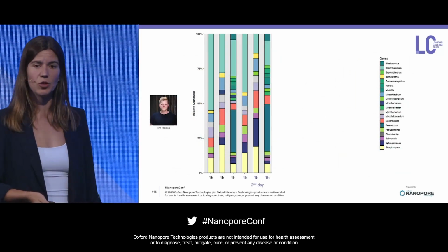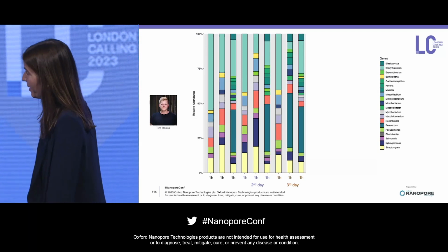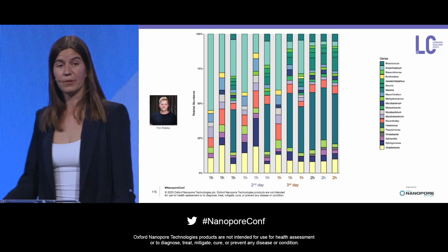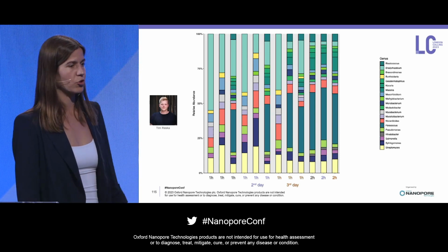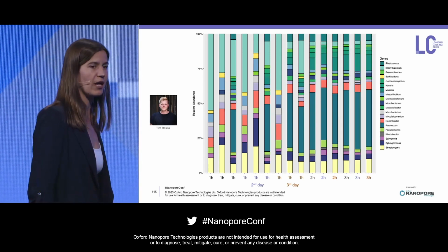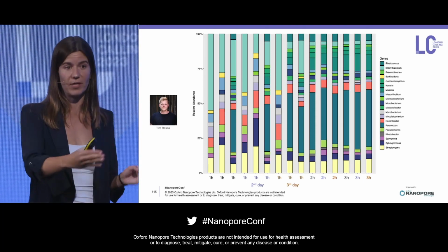We did this again on another day, again a lot of variability, and the third time we see the same thing. But then we actually went in and sampled for 2 hours in a row. And you see that actually after 2 hours of sampling, using just nanopore shotgun sequencing, we can assess a quite stable air microbiome. And especially after 3 hours, we see a really robust signal across different days.